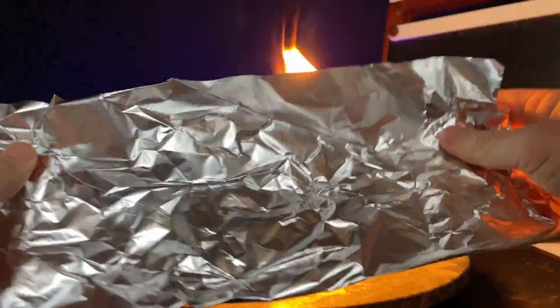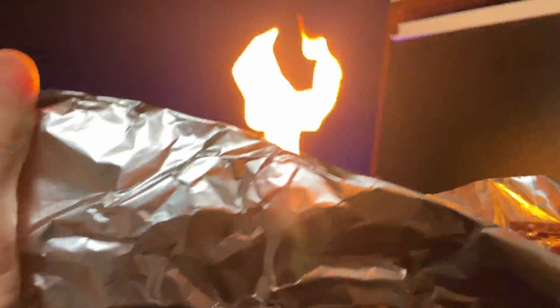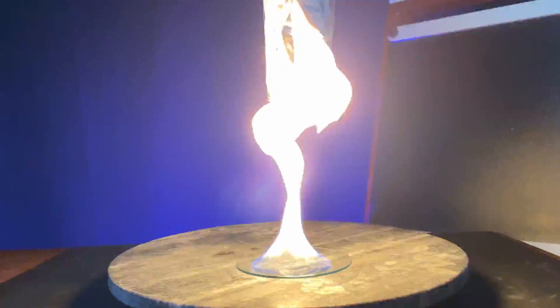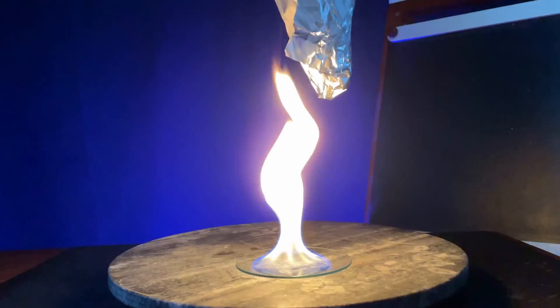The last thing I'll note is what happens if you put a spiraled aluminum sheet on a string above the flame. You see the aluminum begin to spin. There are a few more interesting applications to this. If you know any, jot them down in the comments.